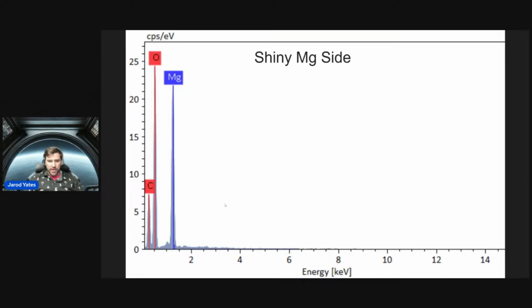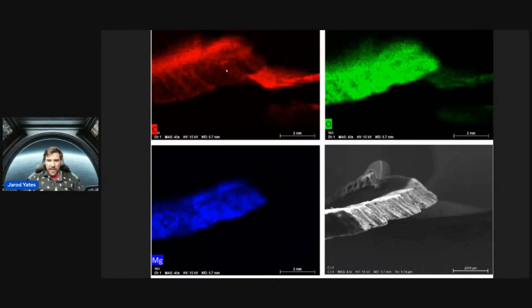Don't worry about this for now because we're going to have a lot better ones coming up. But in that, we have carbon over here in red. You can see that is actually sitting on the testing surface here, not the testing sample. So there's a little bit of pollutant going on in this image. We have other images coming up that are much less polluted.